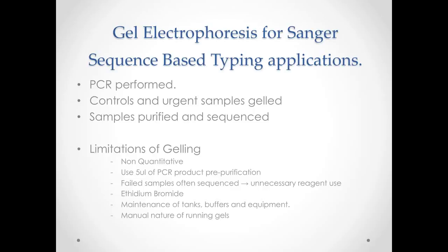Like any manual task, there is risk in repetition, the risk of sample mix-up in the manual transfer, and there is definitely a risk of getting busy with another task and letting your gel run off. And of course, dropping the odd gel or two was never unheard of. So whilst changing to another system would eliminate these limitations, our major reason for changing was the swap to next generation sequencing, as it required a quantitative and qualitative instrument.